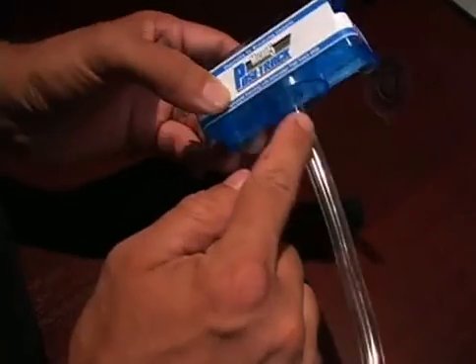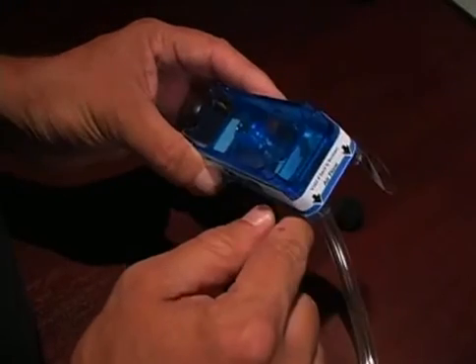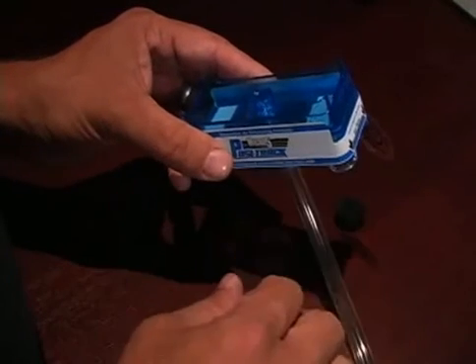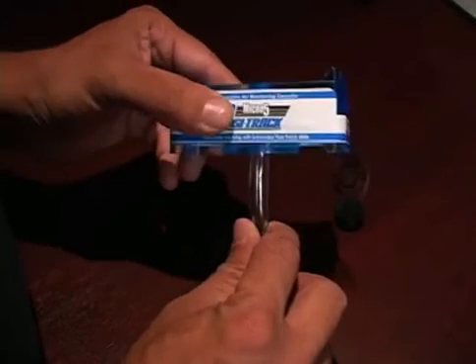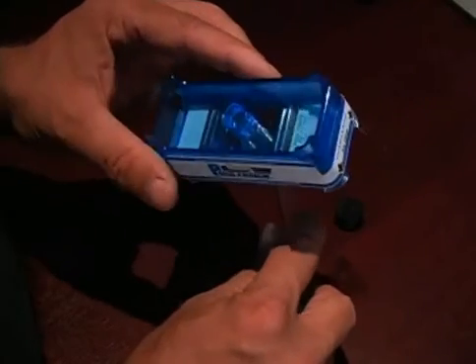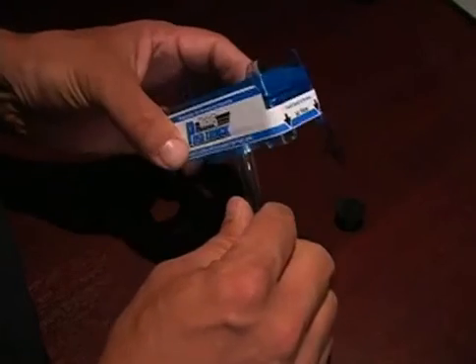Record the time that you turn on the pump, and sample for 5 minutes, or depending on the environment. Outdoor samples, 5 minutes. Clean indoor environments, 5 minutes. Normal activity indoors, 5 minutes. Indoor, let's say there's heavy particulates, there's something going on, some dust, you're concerned about too much stuff going inside, you can go down to 3 minutes. An inner wall sampling could be 1 to 5 minutes.